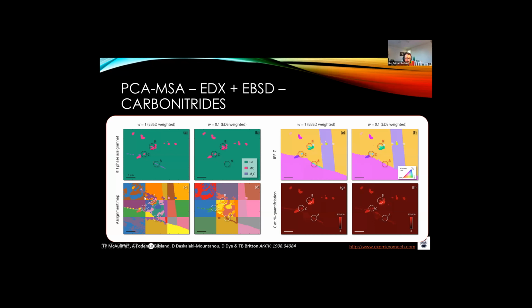And this creates some small issues. We can imagine a slight algorithm, a sort of seam mending problem, where we could overlap and check, should we call these the same thing, but that was a nuance that wasn't too important. It does do one subtle thing, and you can see this here. I didn't talk through this particular data set, but we've taken the characteristic signal and we describe everything with that label by the chemistry of that particular characteristic energy dispersive X-ray spectroscopy.